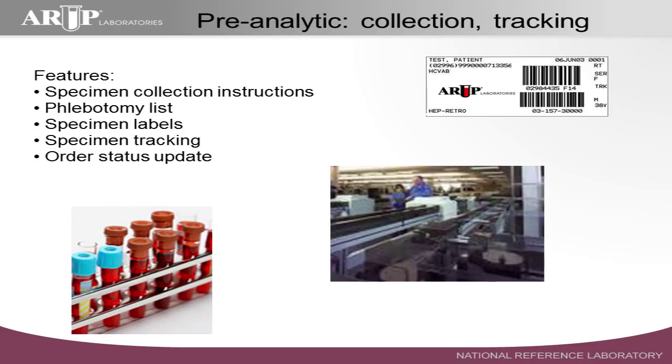So when the laboratory management team works with the nurse and hospital management team, they decide, okay, when do the phlebotomists need to do their draws? What are the typical rounds? What areas do we have to go hit or be present in? And they set that up in the system before, so this information can be automatically generated for the phlebotomist.